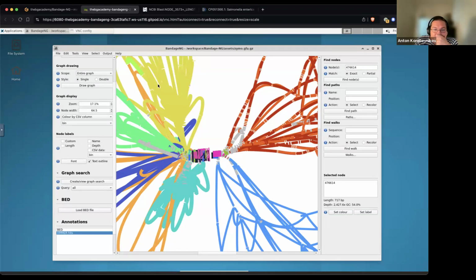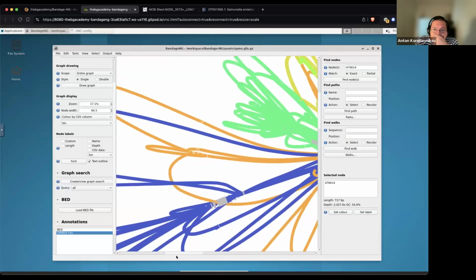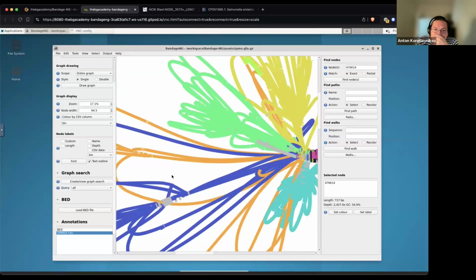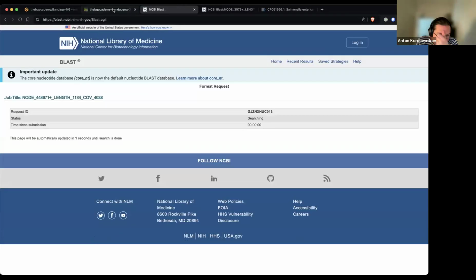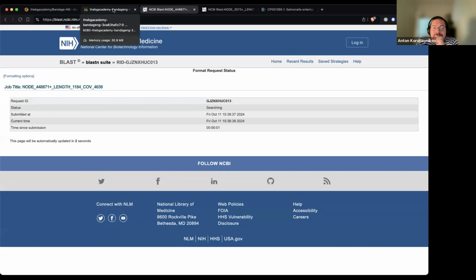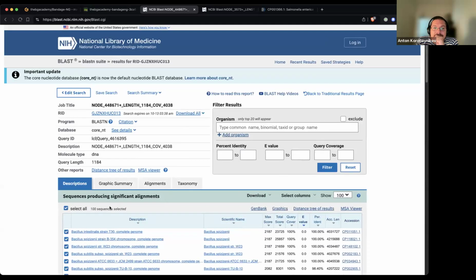But besides that, you can see that everything is pretty well separated. Certainly we do have some unbinned pieces here, and if you want, we can even manually enrich our MAGs, right? This probably was just too short, but we can double check what's going on and see who this guy is.